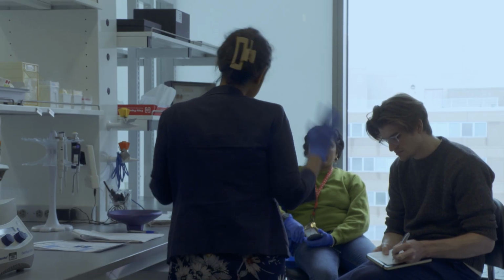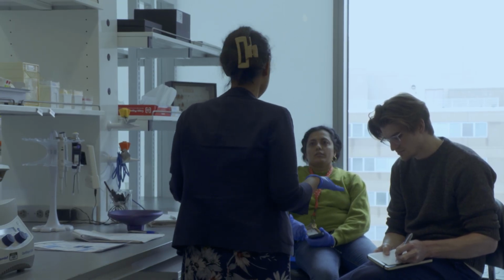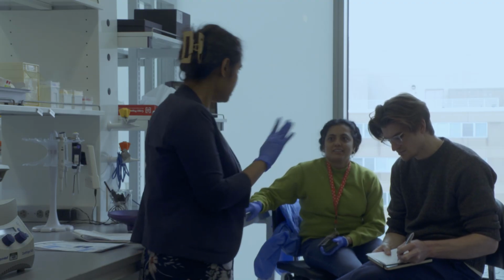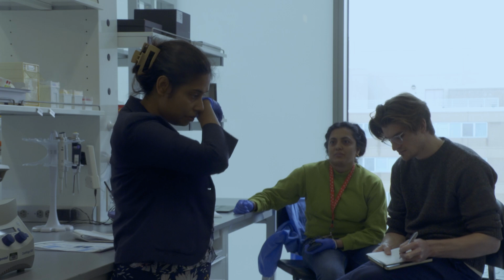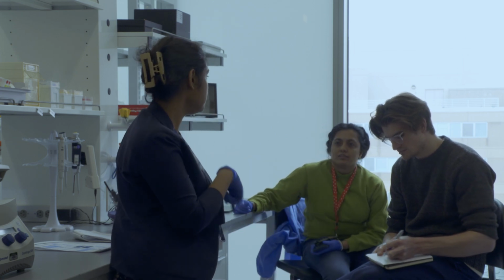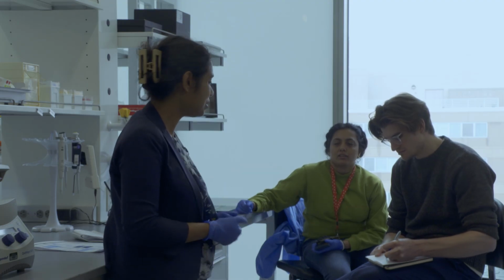Okay. And when you do that addition, that's the library done. Yeah, that's easy. It is, but this is still, I would say, the lengthiest protocol, because of all the enzymatic steps and then purification.